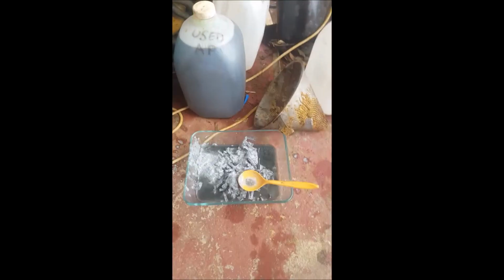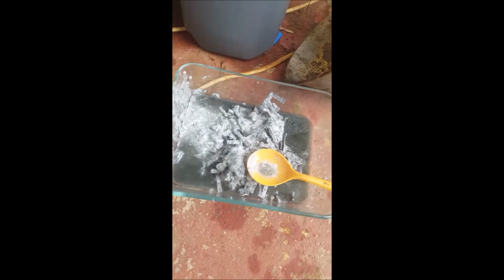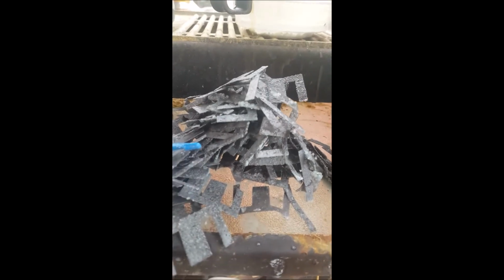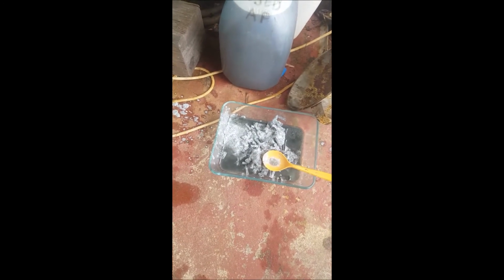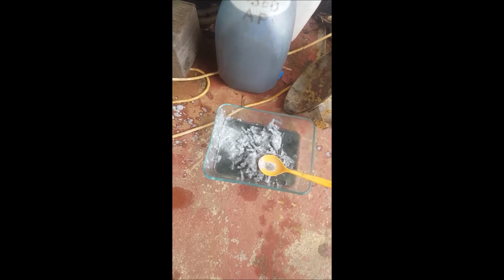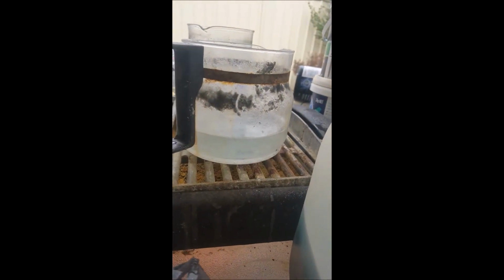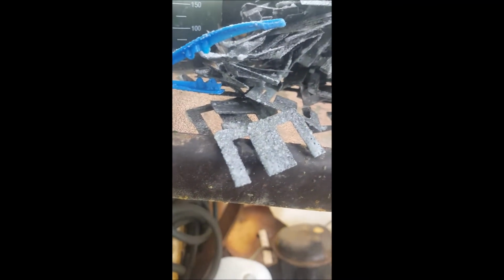It's looking good. What I've done is I've just tipped all the solution out of the pot into here so I can pick all the bits of metal out. I've already got quite a few of them there. I think it might have been a bad idea using the pot, because most of the crystals had stuck to the bottom of the pot. So I've put some more water in there, hoping it'll loosen up, but it's all the crystals I want, so now I've got to get a knife and scrape all that off, I imagine.